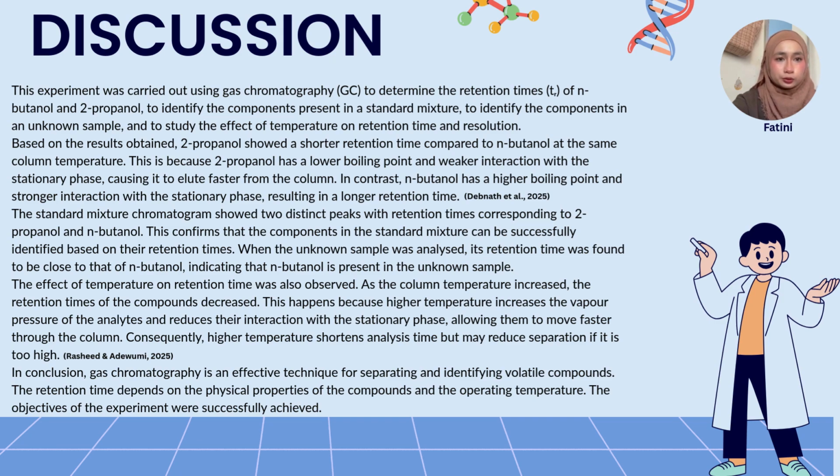The standard mixture chromatogram showed two distinct peaks with retention times corresponding to 2-propanol and N-butanol. This confirms that the components in the standard mixture can be successfully identified based on their retention times. When the unknown sample was analyzed, its retention time was found to be close to that of N-butanol, indicating that N-butanol is present in the unknown sample.